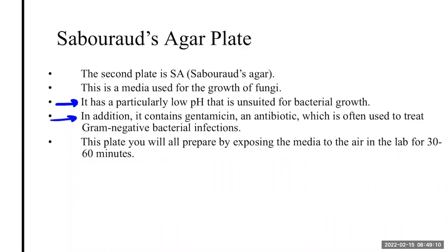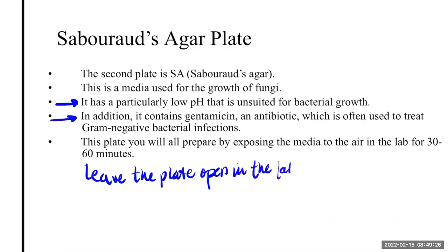So with this plate, you will prepare it by exposing the media to air in the laboratory for 30 to 60 minutes. So you're just going to leave this plate open in the lab for 30 to 60 minutes.